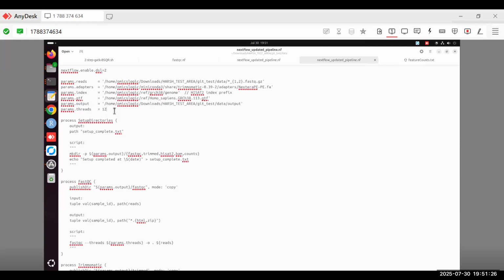Ma'am, how do we take care of a scenario where we've done the first QC and trimmed, but the quality is still not so good, and we want to do the trimming again? Can we add that process? You want to do the trimming again.